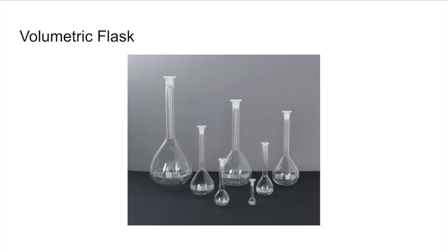Next up, we have the volumetric flask. So what this flask does is for the purpose of mixing solutions, and you would put the first solution in and then fill it up to the top with the second solution and mix them in order to find your new solution. Next up, we have some labs we did in our class this year.